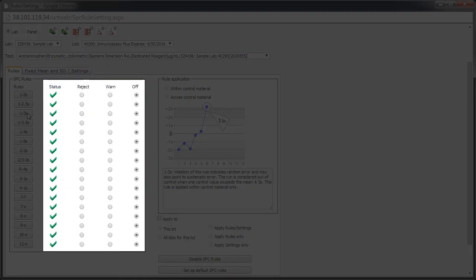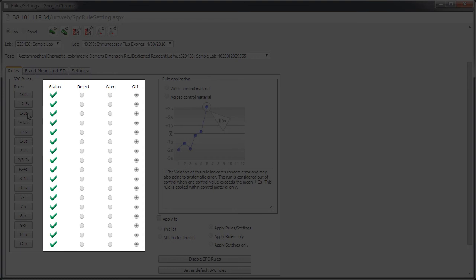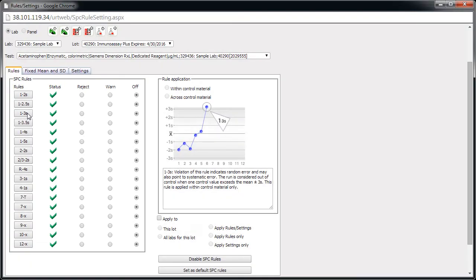In this section, you can choose the status for each rule. This includes Reject, Warn, or Off. The default setting is off. Points that are rejected are not submitted to the peer group. Points that are flagged with a warning are submitted. Let's set up one rule to warn and one to reject.